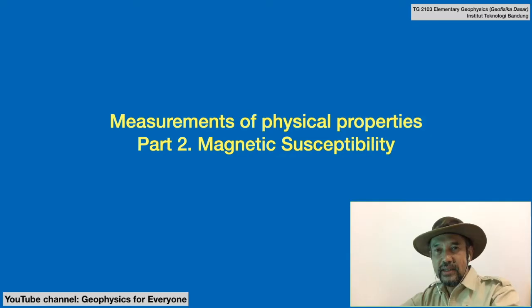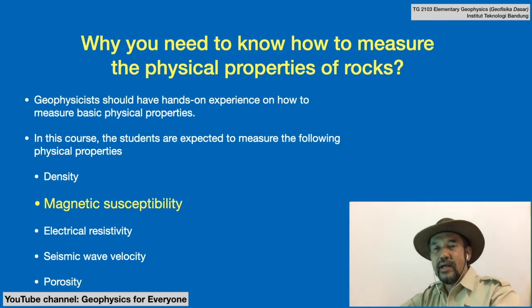Today we are going to talk about the measurement of magnetic susceptibility. This video is a part of a series that is intended for the second year courses at Institut Teknologi Bandung, called Elementary Geophysics. So why do we have to measure the magnetic susceptibility by ourselves?